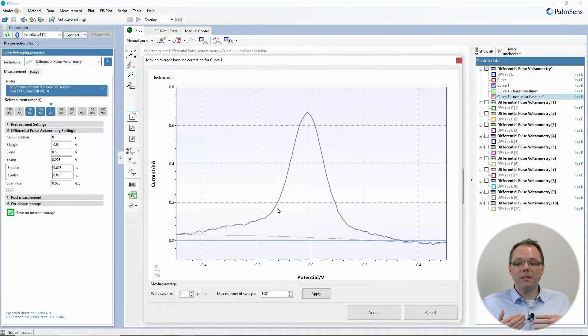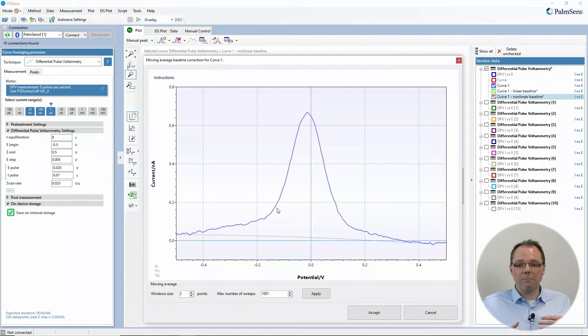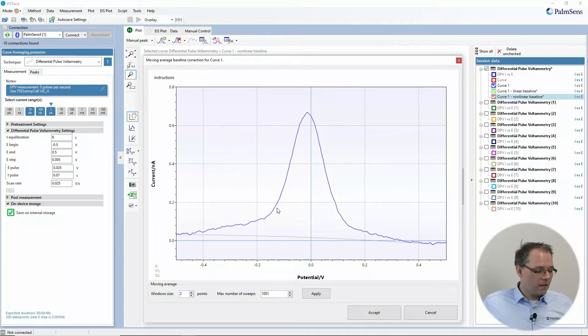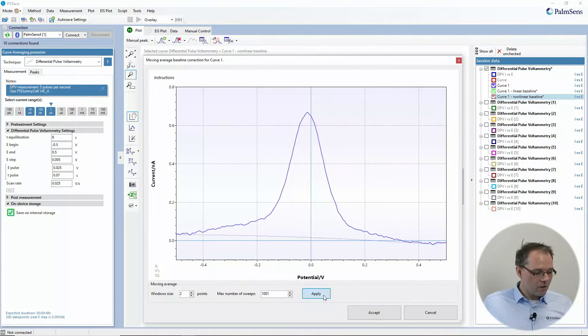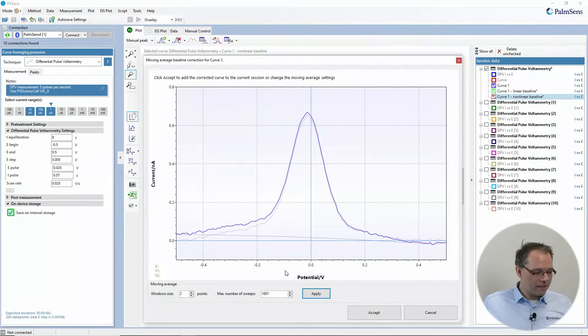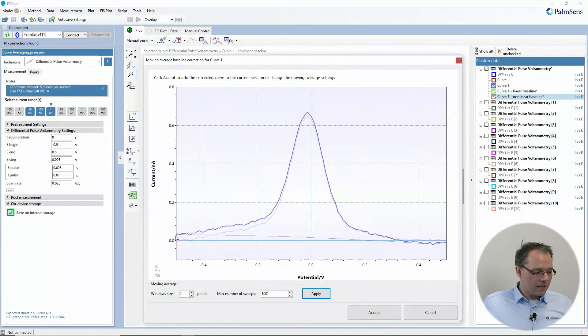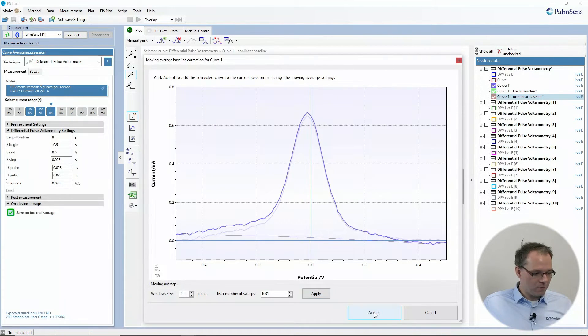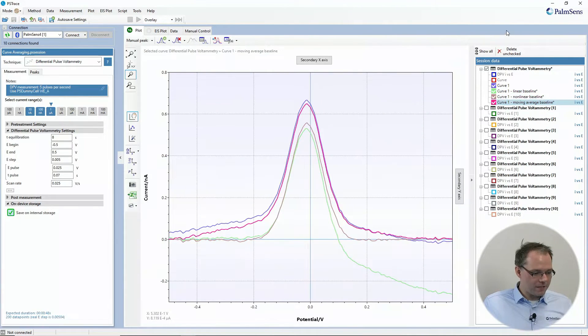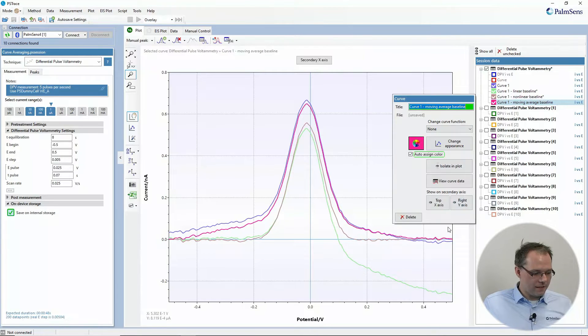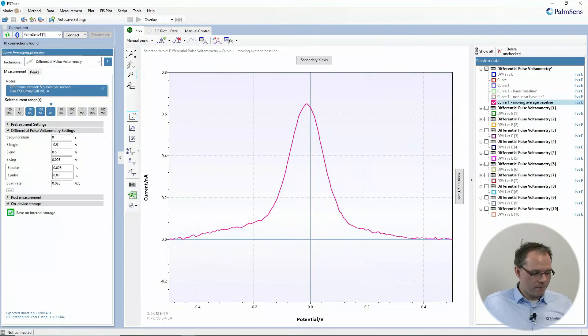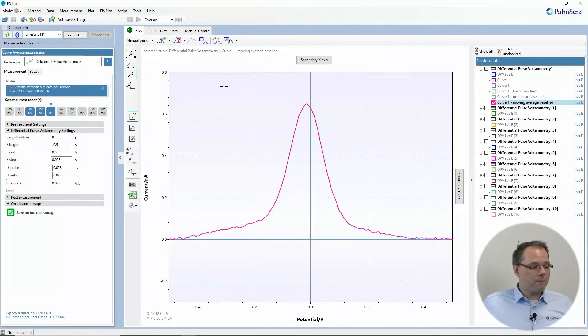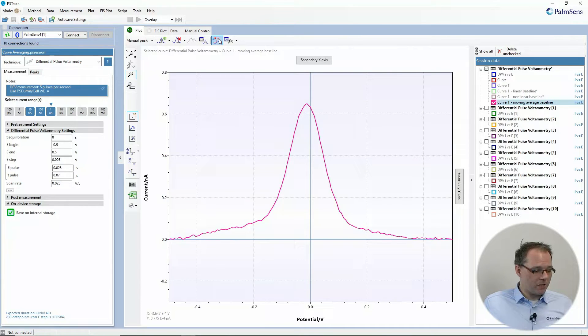So we can apply this and then you see that it's making this new curve, which is very pale. Well, once we've accepted it, we can actually nicely see this new curve. There we go. These are the different baseline operations.